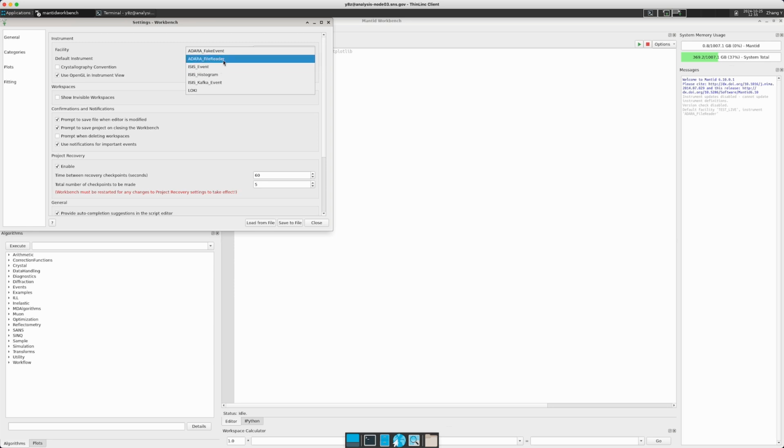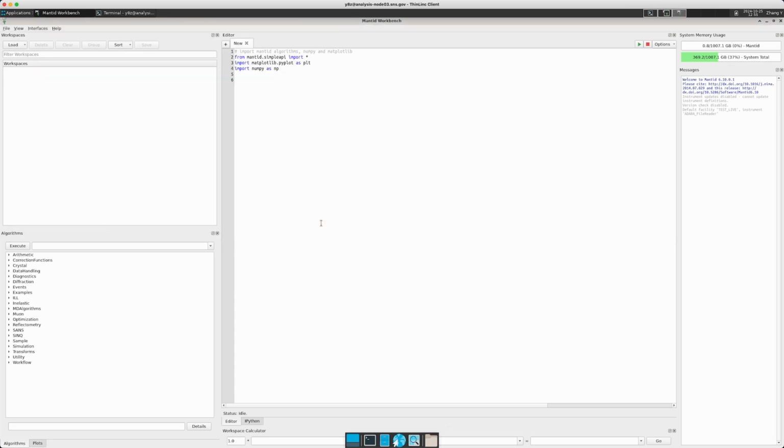If you choose Adara file reader, that can take a pre-existing event file, the NeXus file, and then the whole testing engine can use that data to create a dummy live stream, given the data we choose for testing purposes. That's the only setting that we want to go through to tell the program that we want to use a local file as a testing target.